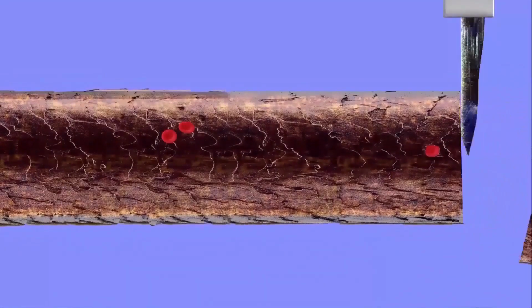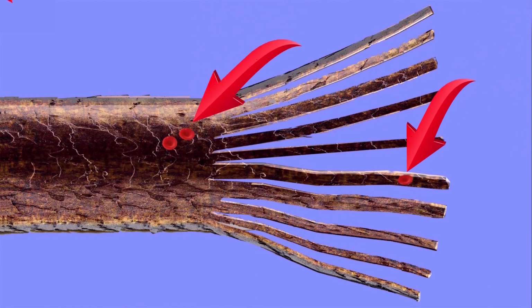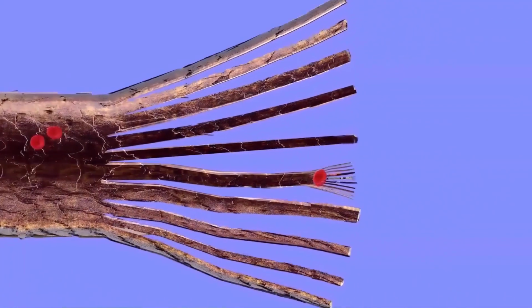So now this single hair will be split into divisions, the ultimate demonstration of split ends. The 3 erythrocytes are still visible in position. And I will take this central example and will subdivide that again into 10. This strand is now 100 times smaller than the width of the hair. We can now increase the magnification and move in closer.